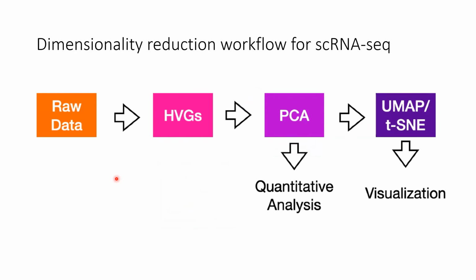And to be frank, we still don't really know. The steps to prepare single cell RNA-seq data for cell clustering are a very active area of research. And today I'll be presenting the standard method in the field for preparing single cell RNA-seq data for cell type clustering. However, I think the field desperately needs to better validate these steps.